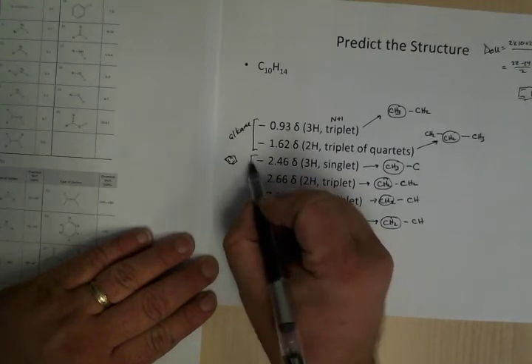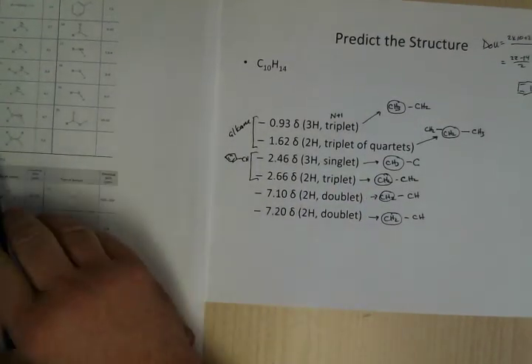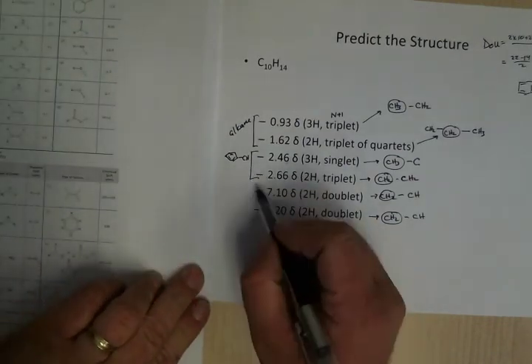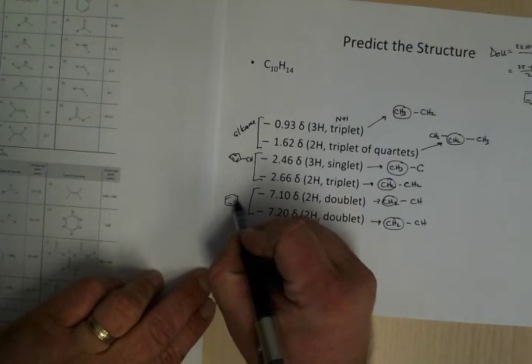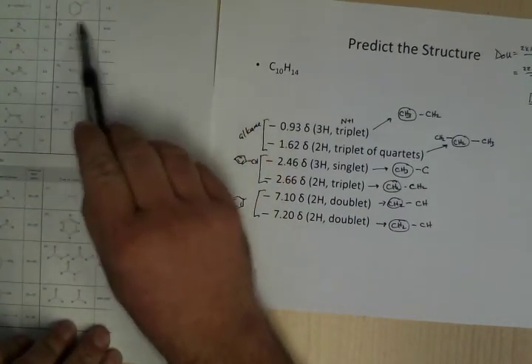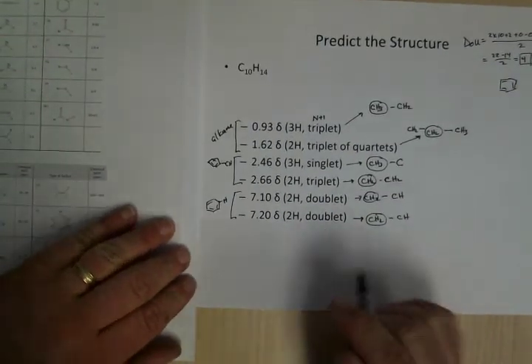Okay, actually both of these look like they're probably next to a benzene, right? Because they're both right around 2.5. And then these guys here are going to be on the benzene itself, because that is a big fingerprint region right around 7. It's going to be on the benzene itself.